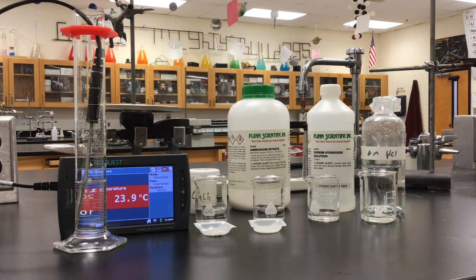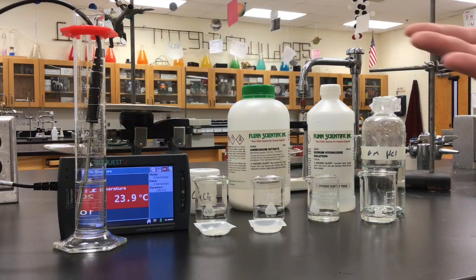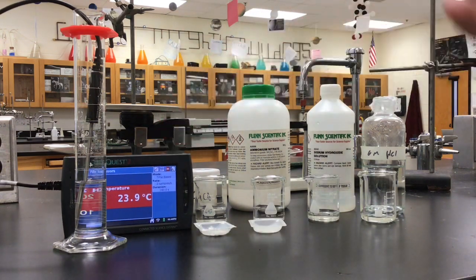If we see the temperature go up on our temperature probe here, we'll say that the surroundings are gaining heat. And if we see the temperature go down on our probe, we'll be saying that the surroundings are losing heat. Then we have to infer what the molecules are doing based off of what the surroundings do. So if the surroundings gain, then that means the molecules, the system, must lose, and so on and so forth.